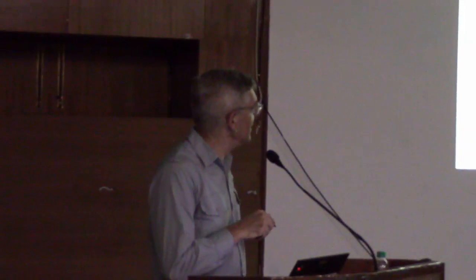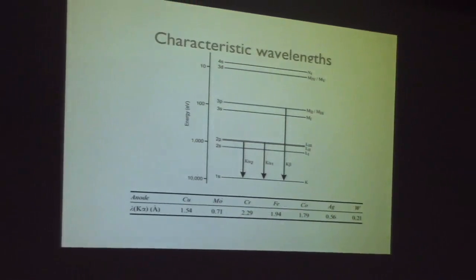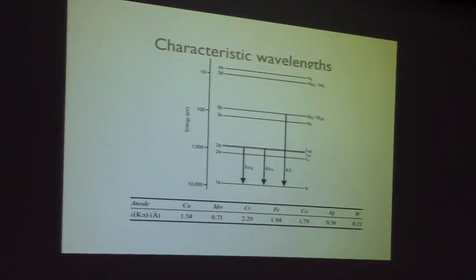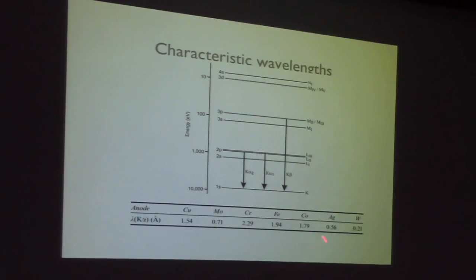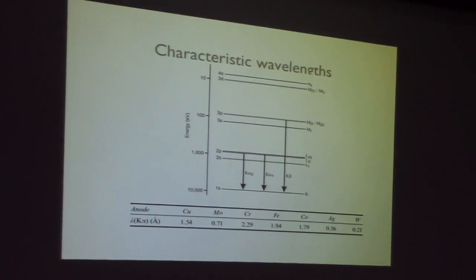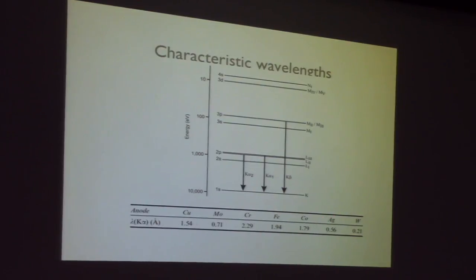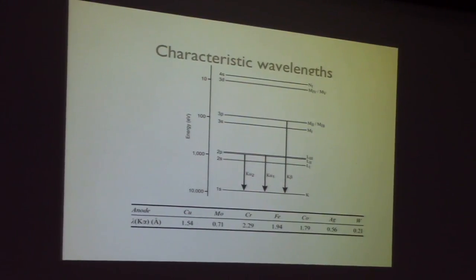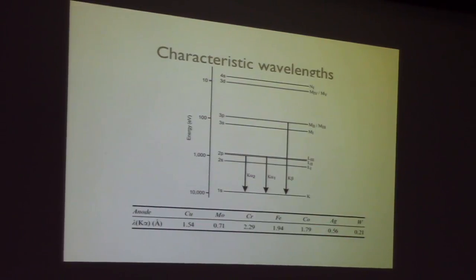So if you're doing diffraction and you're going to analyze the data with something like Rietveld refinement, you're going to analyze it in reciprocal space, then you do want to use these guys, long wavelength. And if you're doing PDF, you don't mind about the resolution in Q space, but you want a wide Q range, so you use these guys.